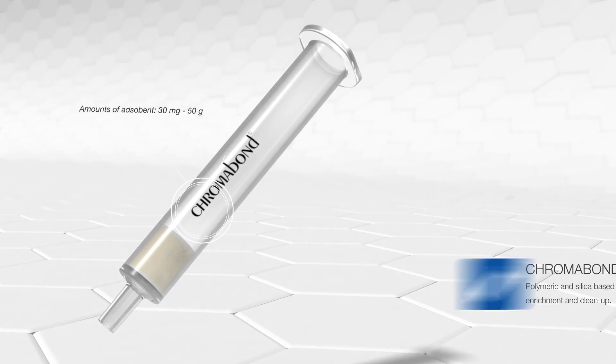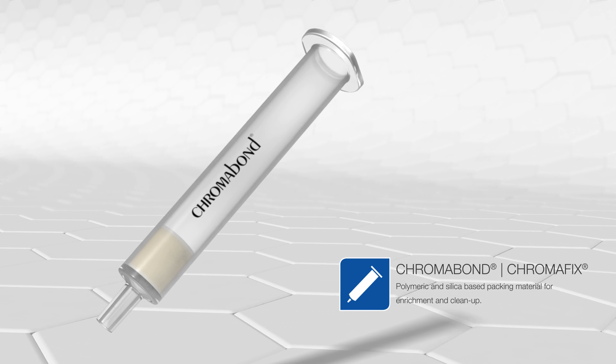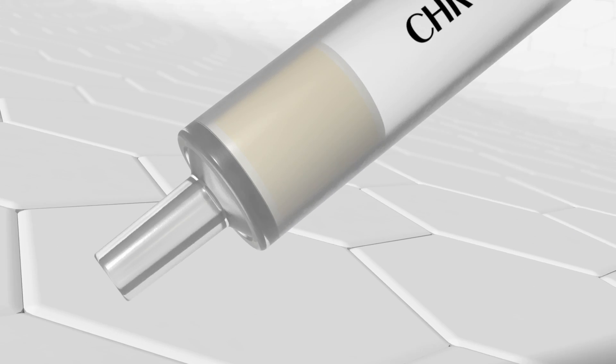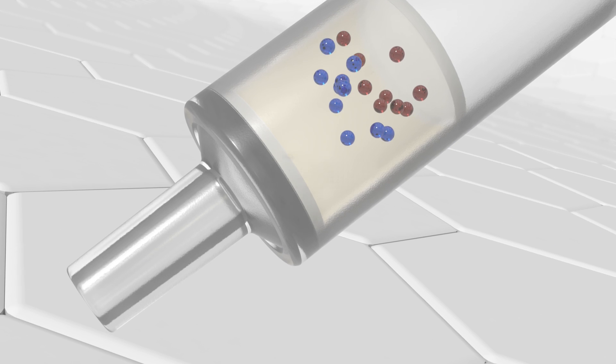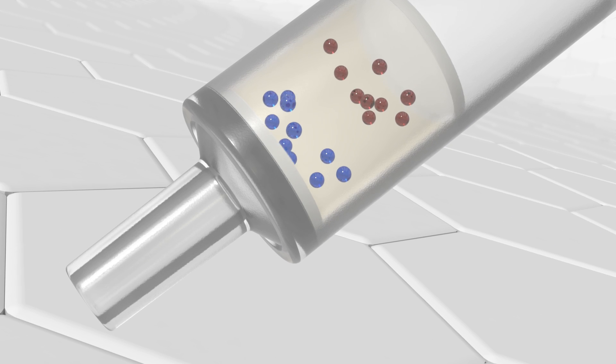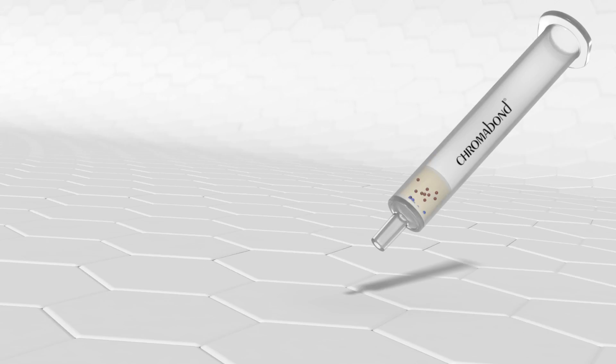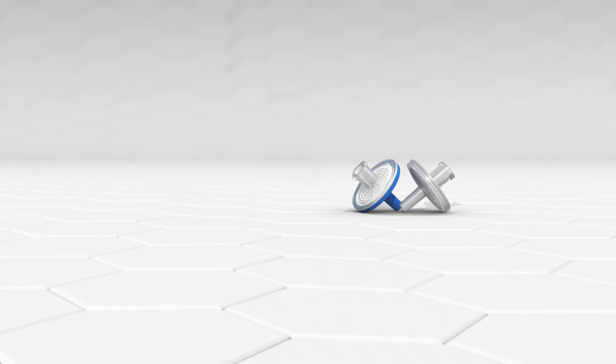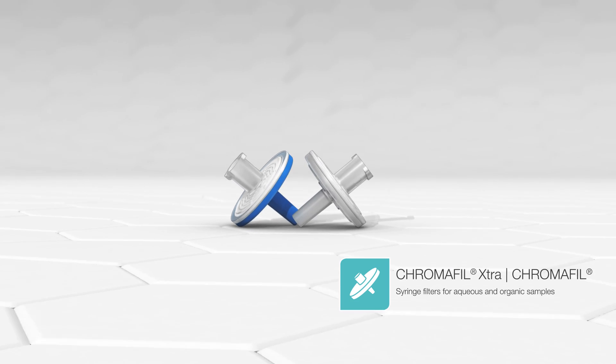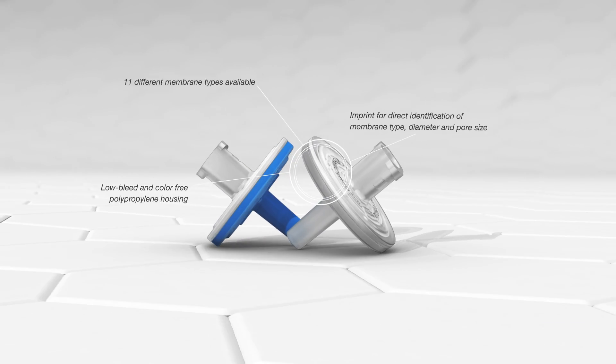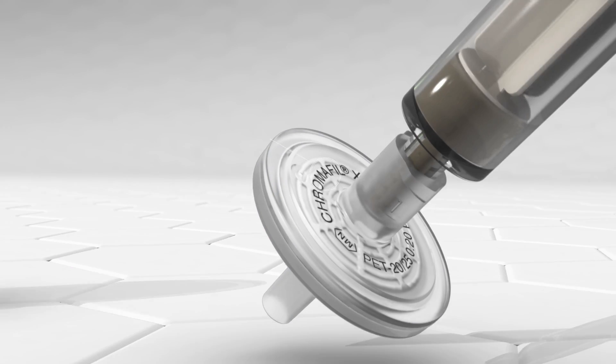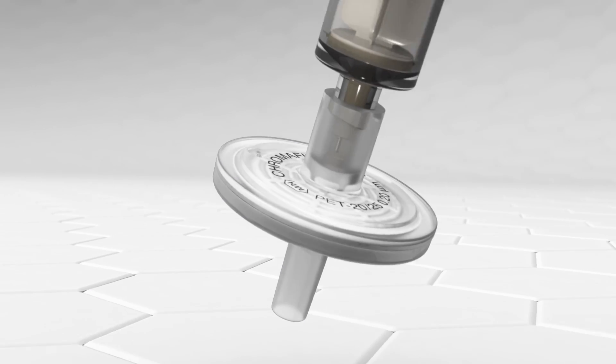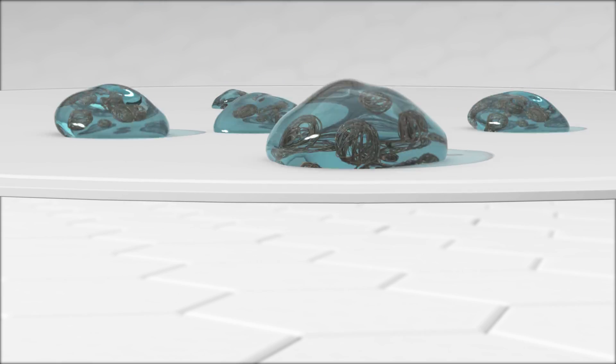We manufacture premium SPE columns for concentration and cleanup of your target compounds from complex sample matrices. Our robust and contaminant-free syringe filters help you to clarify liquid samples in order to protect sensitive and expensive laboratory equipment.